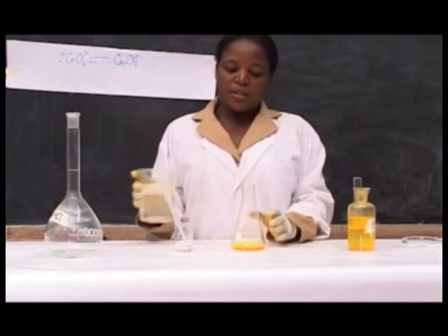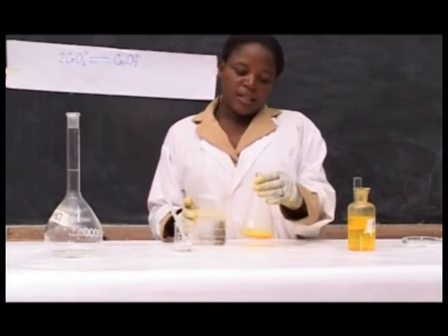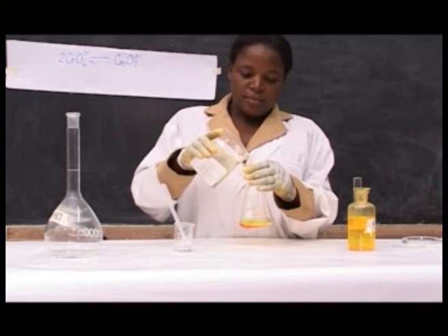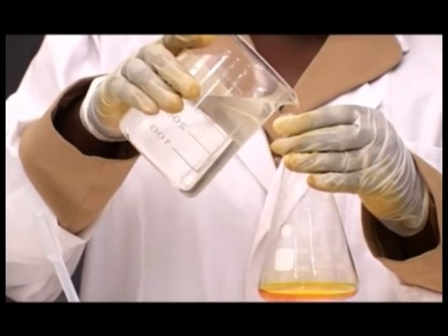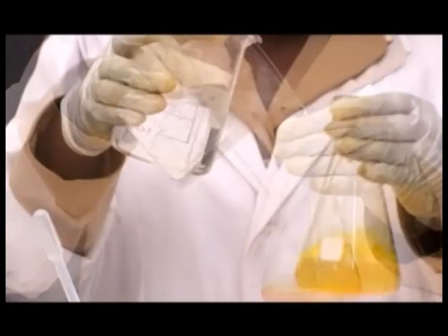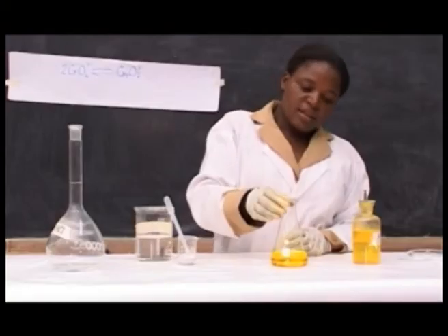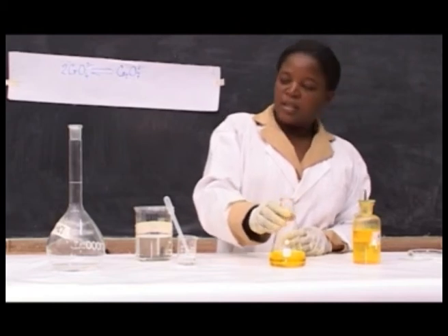Add distilled water to this solution until the yellow color of the solution is regained. The yellow color has been regained.